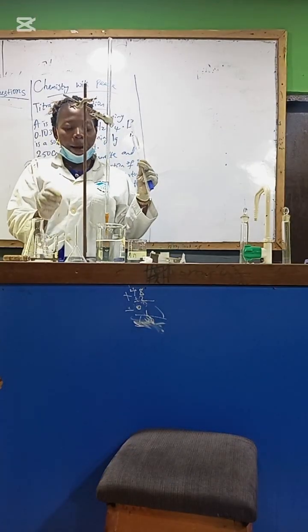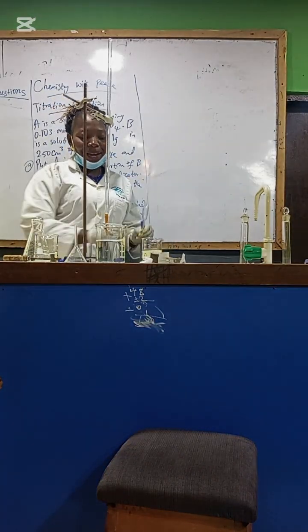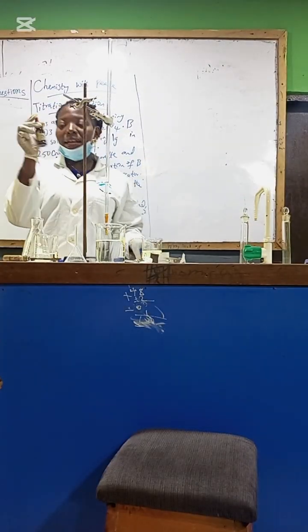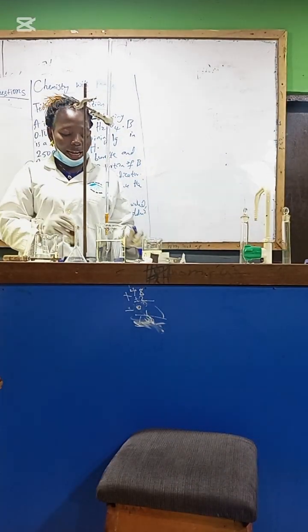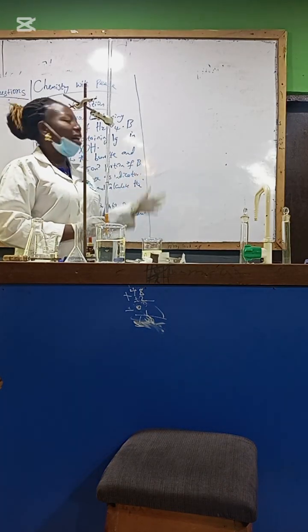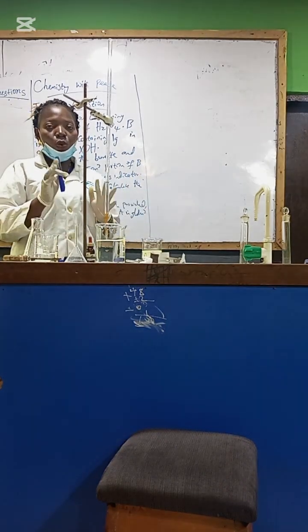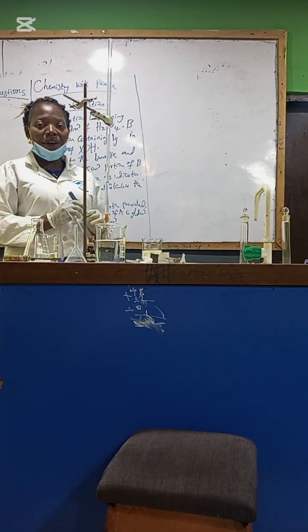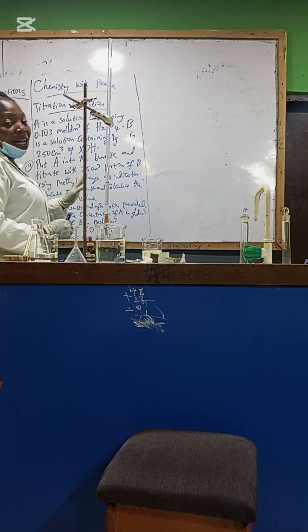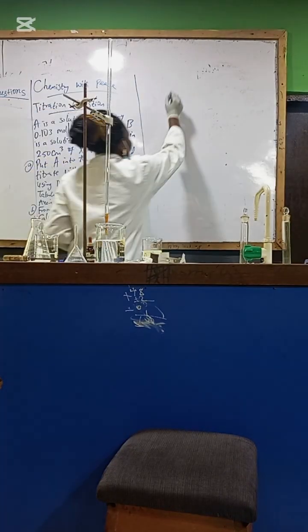We have our pipettes, then we also have our indicator, phenolphthalein, as an indicator. So to start this, let's first of all write our table. Then we are going to titrate to get our value, in order to answer this first question that says calculate the average titer value.